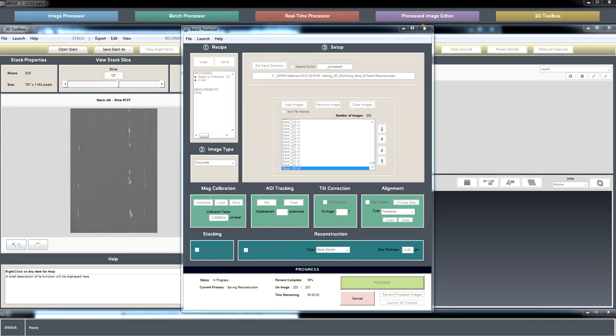I know there are some conventional stereological tools like drawing, what's the term, the nonlinear grid of lines, cycloid grids onto your image to measure intercepts that way. We offer random and rotating line grids to measure intercepts for stereological type measurements. But some of those nonlinear lines we might need to add in.